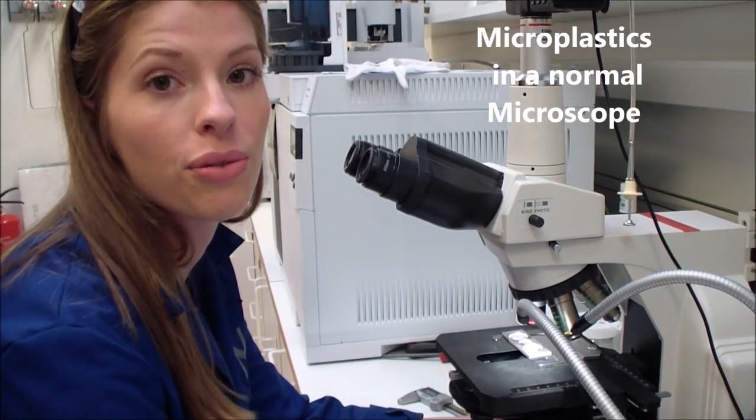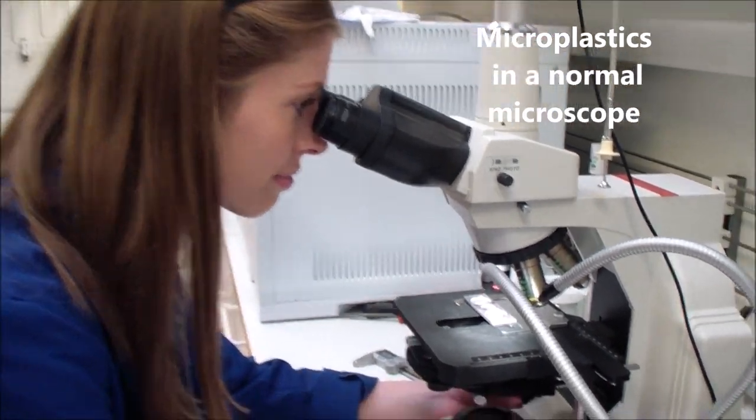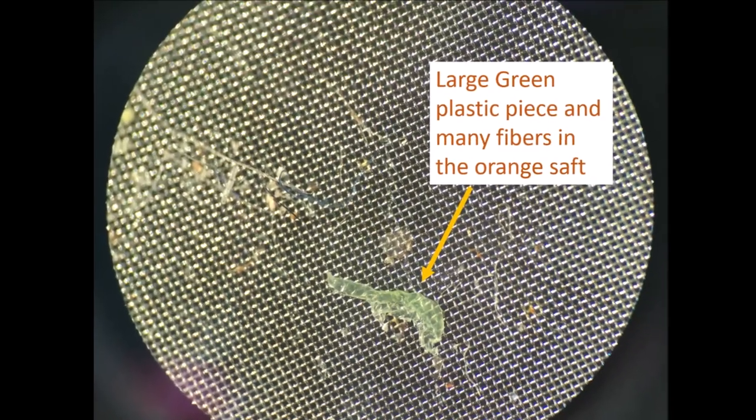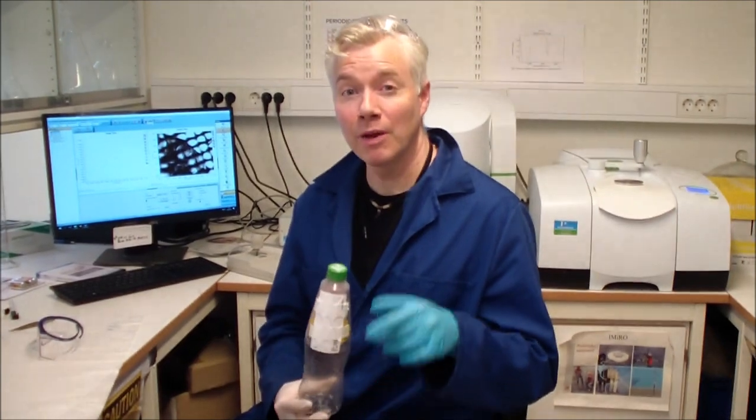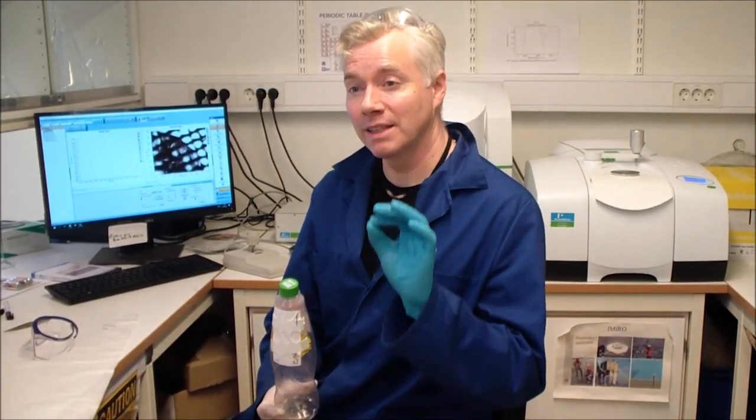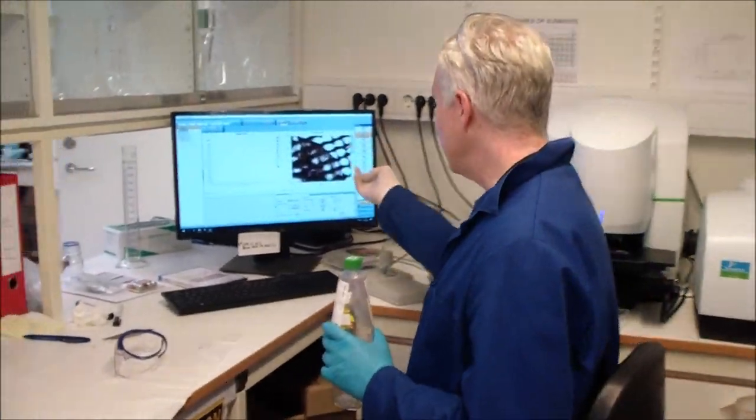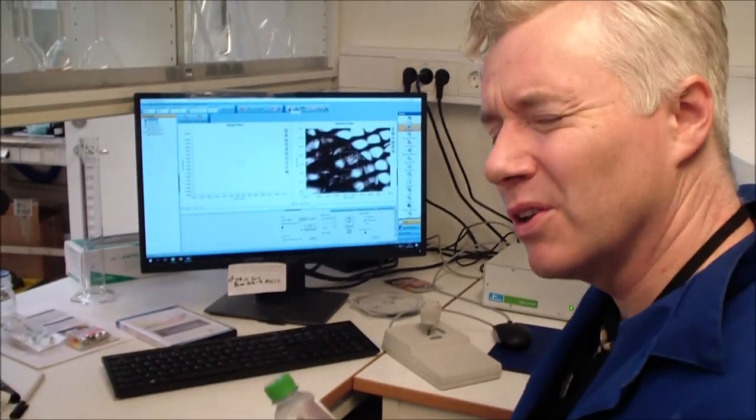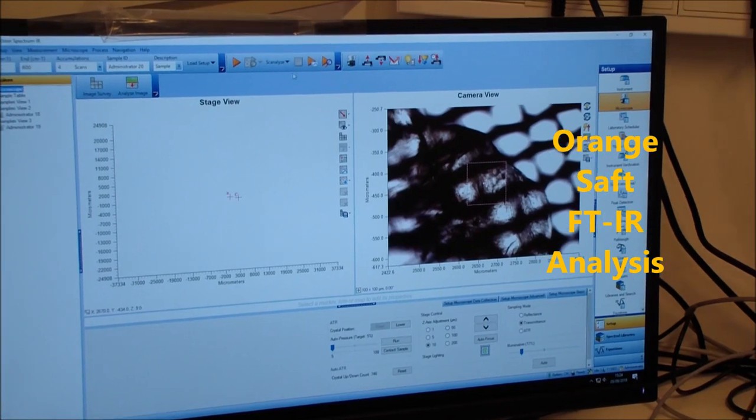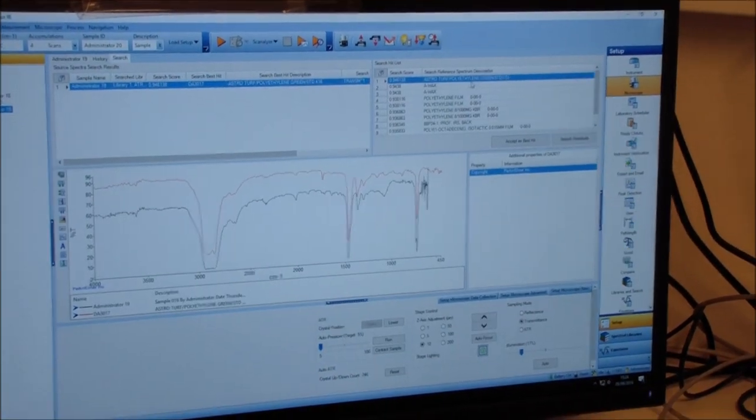I'm looking in the microscope to see how many microplastic particles we got. Now by the FTIR microscope, we can use this to see what is the identity or what type of plastic or other material those particles we saw in the microscope are. So here I have this first particle you might recall from the orange drink, and when I look at the identity, it turns out that it is in fact polyethylene from the cork, most likely.